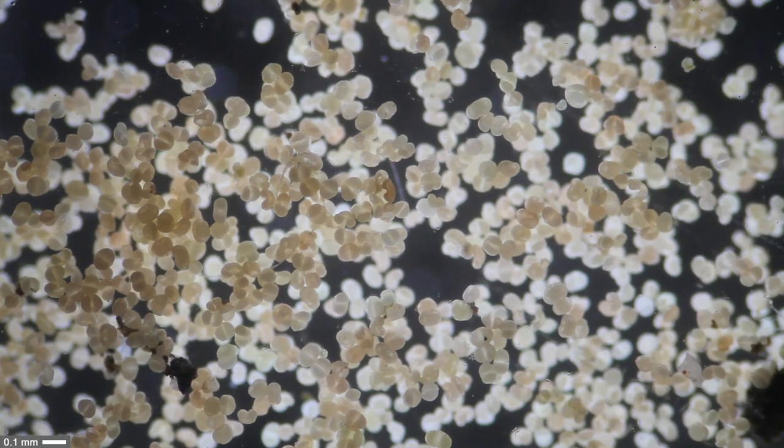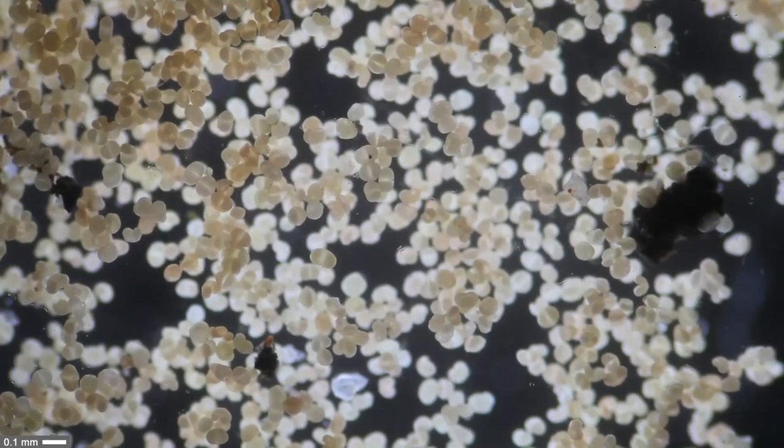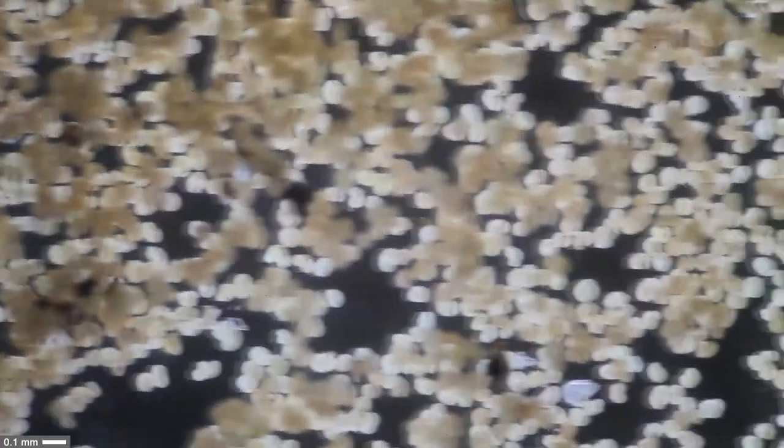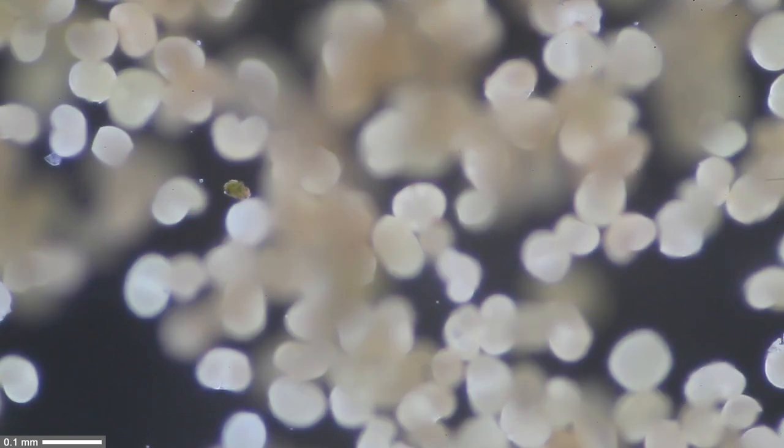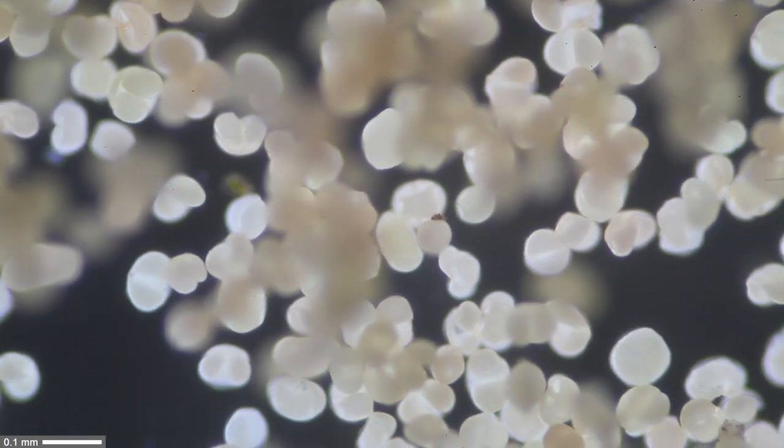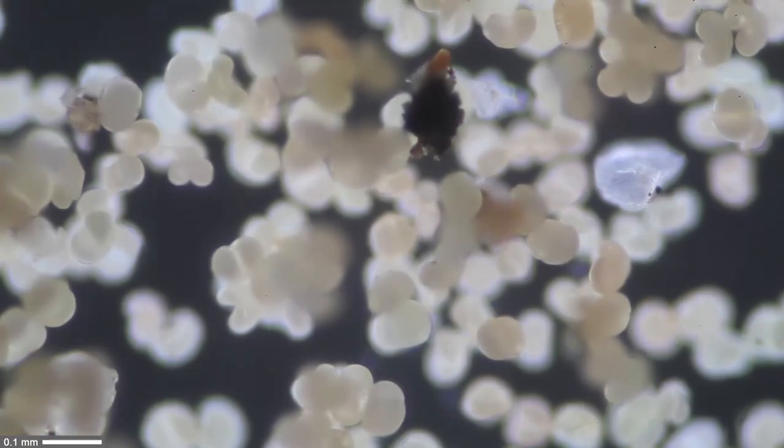Now I'm simply looking at it so that we can also see some micrographs. That is basically in dark field. These are the pollen grains from spruce, the spruce tree. Dark field—the background is dark and the pollen grains are bright. At higher magnification, you can see that some of the pollen grains are a little bit out of focus.